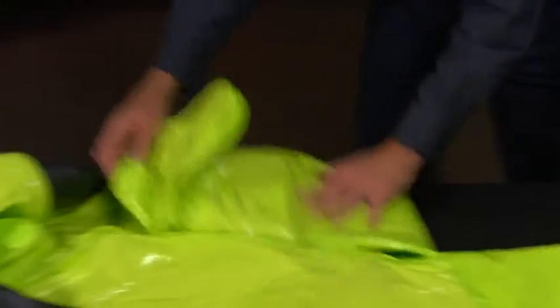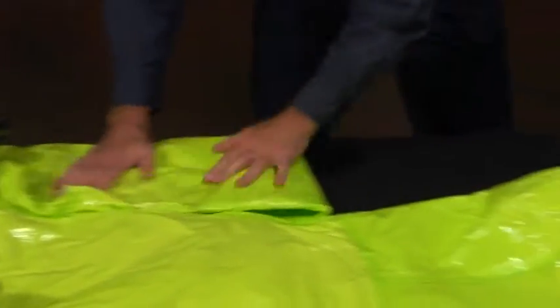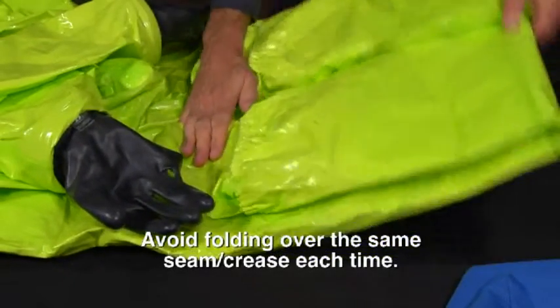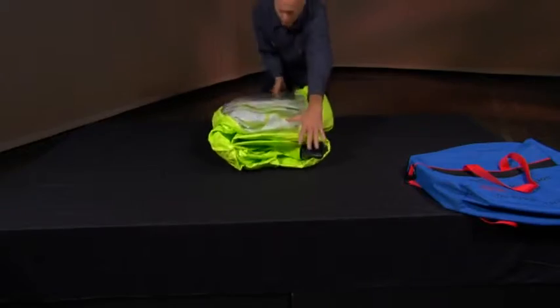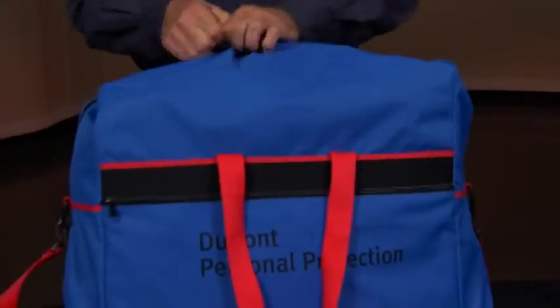The legs should now be folded back at the knees, bringing the attached socks to just below where the gloves are. The garment knees are brought up as the hood is brought back over them, folding the suit in thirds. The folded suit should easily fit back into the storage bag.